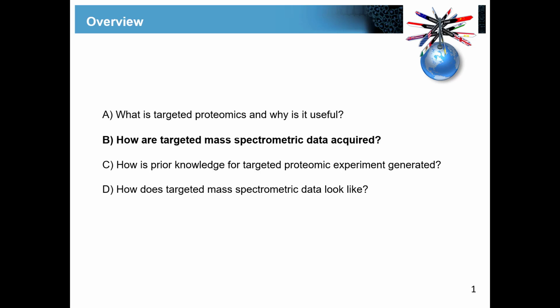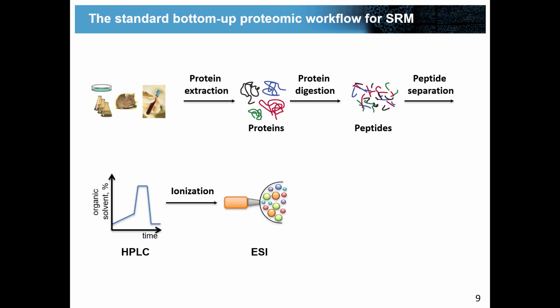Okay, so the second part of this presentation is about getting a little bit more nerdy on the mass spec side and looking at what's going on inside the mass spectrometer and how the data is acquired really in a targeted way. So here you see the standard workflow that is used in bottom-up proteomics. I'm sure you have all seen similar slides many times already before.